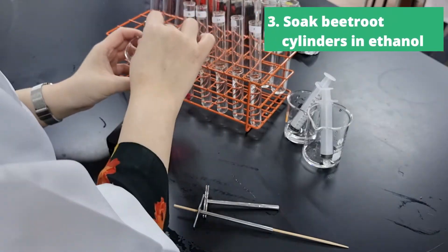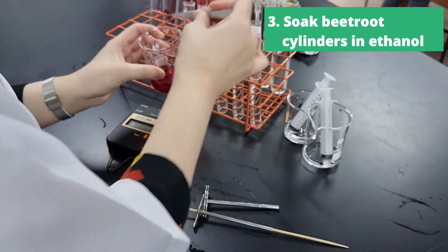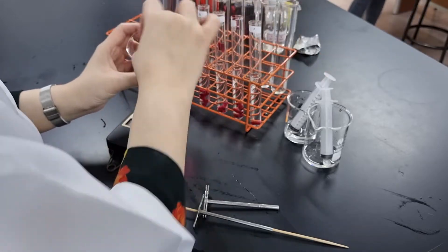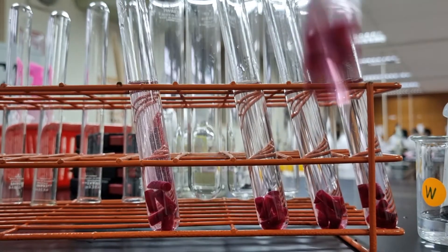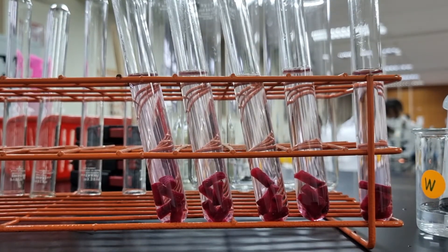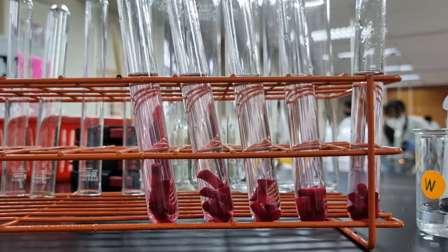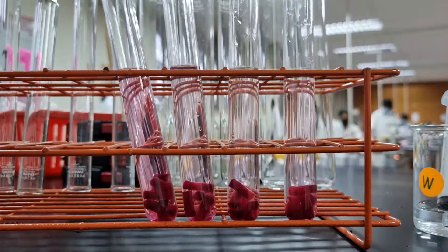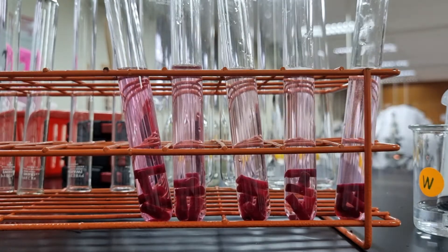After that is done, we actually place five beetroot cylinders into each concentration which are in test tubes here. And then we start the timer. Now this is a source of error because it's humanly impossible to put 25 pieces of beetroot cylinders into each concentration at the same time. It's very difficult. Now as we time 10 minutes, every minute we are going to mix the test tubes a little bit to ensure even dye distribution. And this makes sure that there is an even concentration gradient for the pigment to diffuse down.